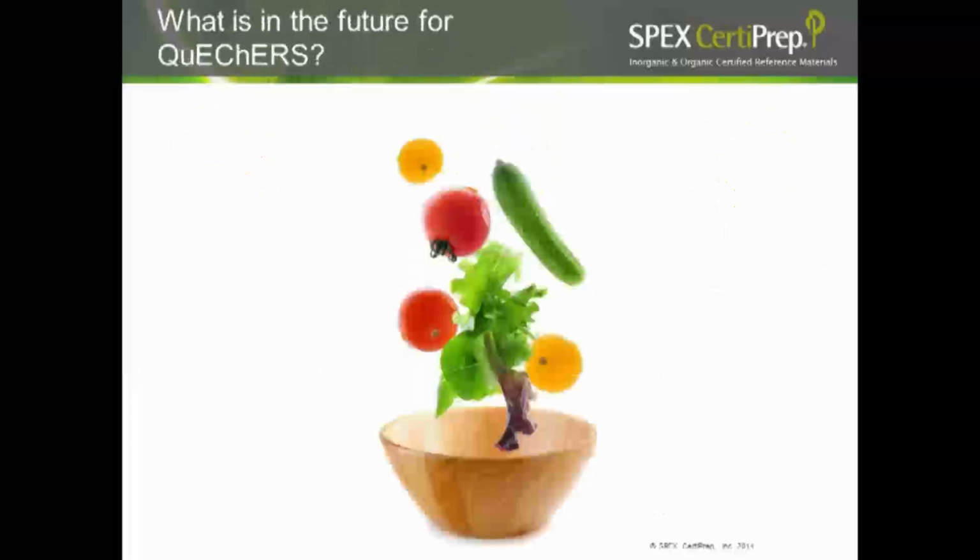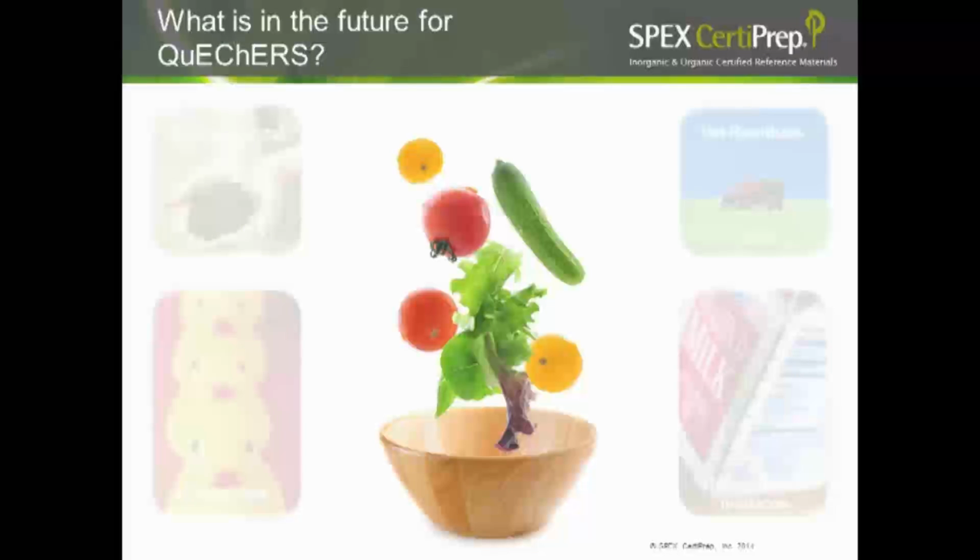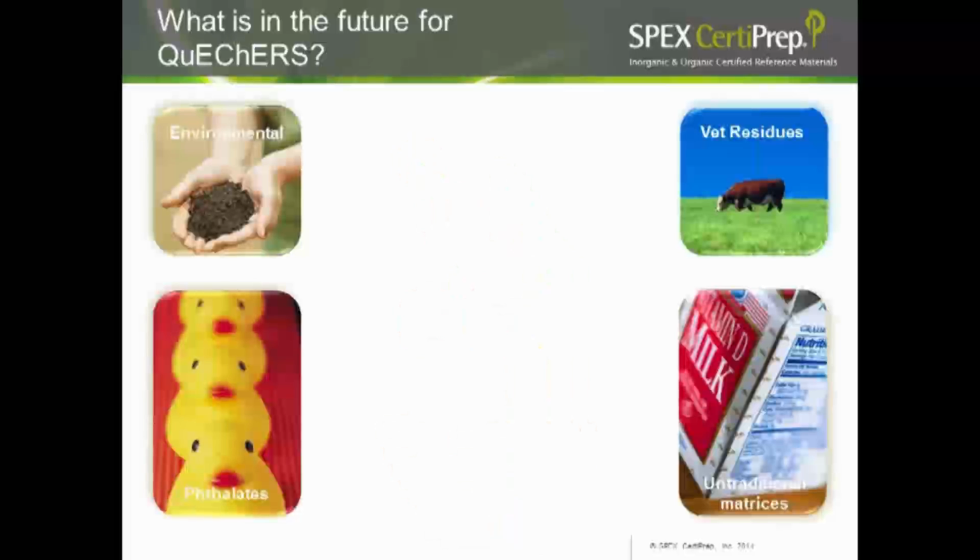So what's in the future for QuEChERS? QuEChERS is being used a lot for some non-traditional samples. We've been asked in the past year a lot about applications for using QuEChERS for environmental samples like soils. We've also been asked, can you test for phthalates using QuEChERS? Vet residues are on the rise being tested by QuEChERS, and untraditional matrices.